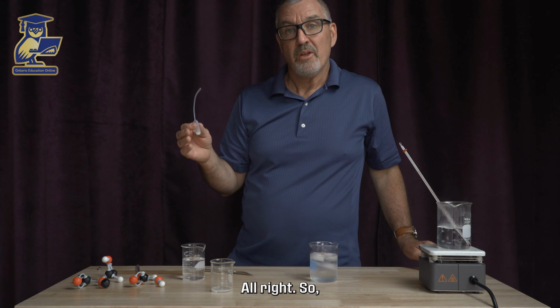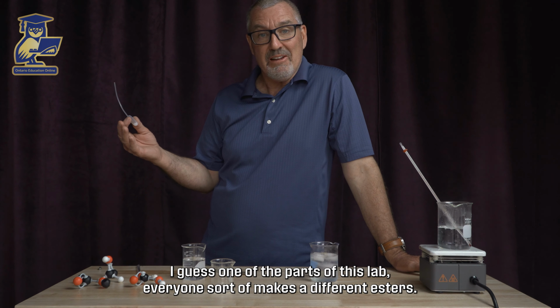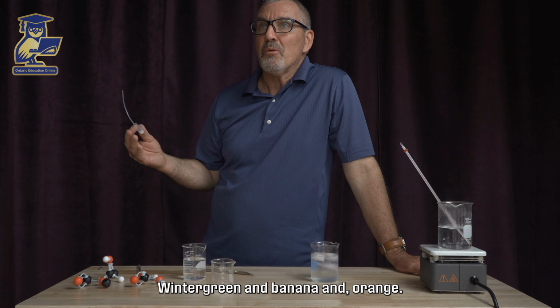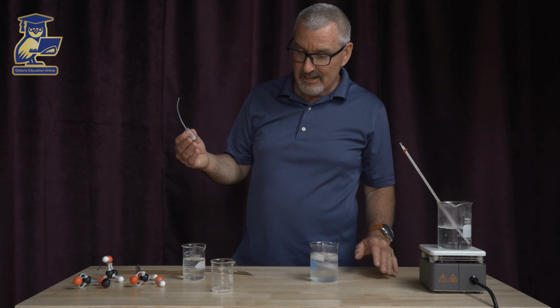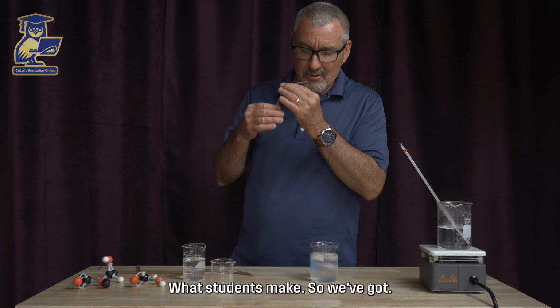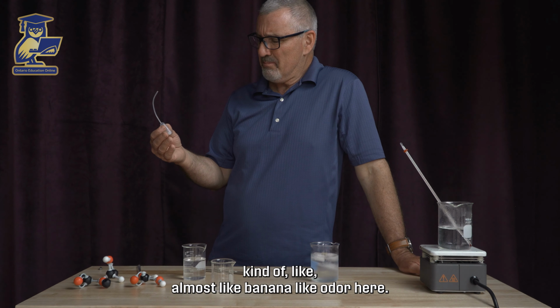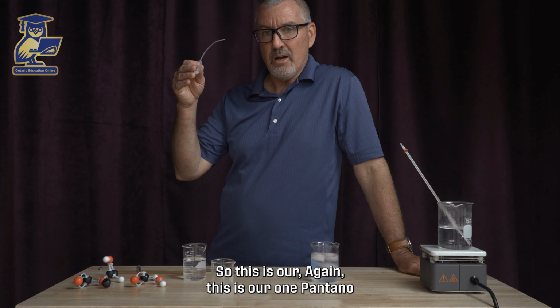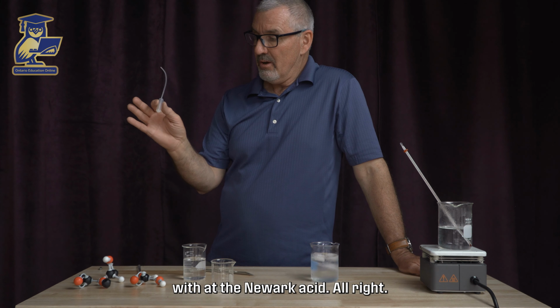All right, so one of the parts of this lab, everyone sort of makes a different ester. So we have all sorts of odors in the classroom, wintergreen and banana and orange, depending upon what students make. We have a really nice fruity, almost banana-like odor here. So this is, again, our 1-pentanol with ethanoic acid.